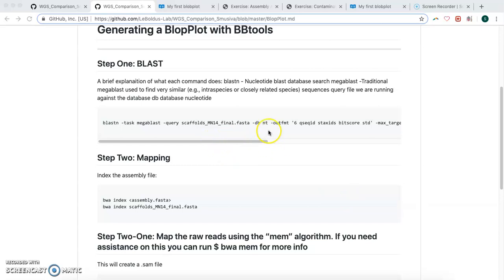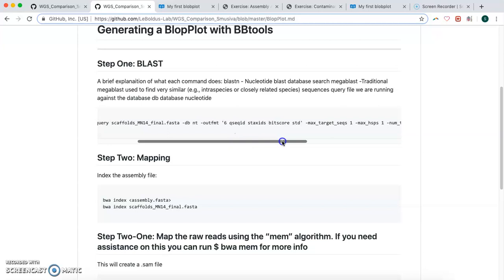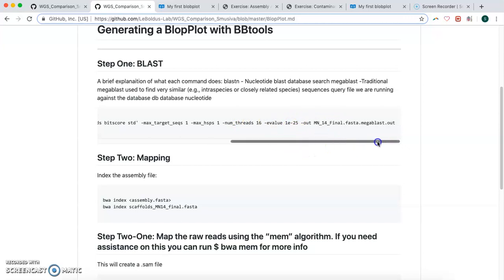So the first step we'll do is we're going to run our assembly file through the BLAST. We want to do a nucleotide blast, and if you want to do blast-h in the command line, it will give you more information on what each one of these steps does.